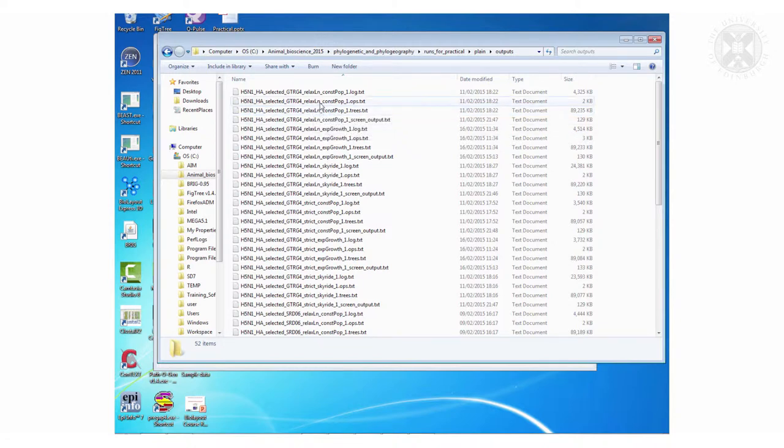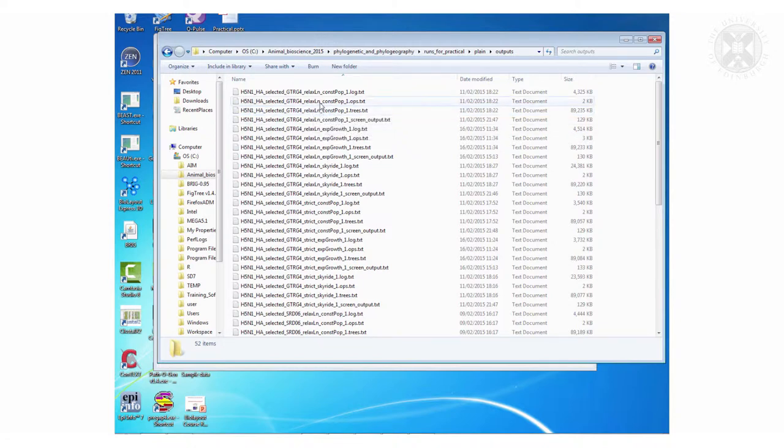You've also got this little ops file is a diagnostic file. It's to do with how well that MCMC chain was running. You don't actually need to do anything about that.